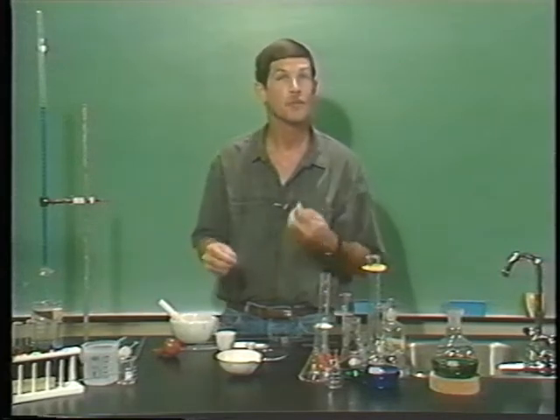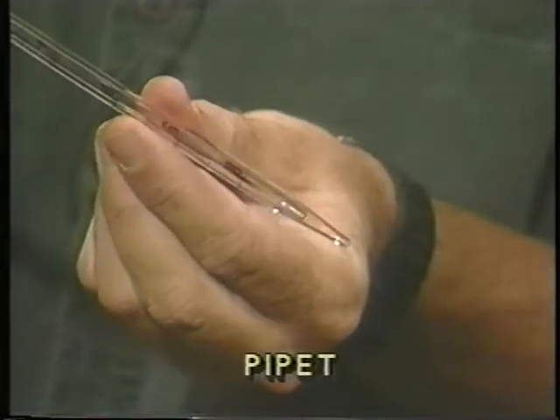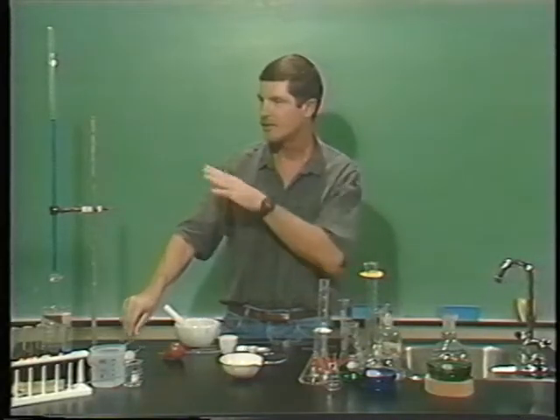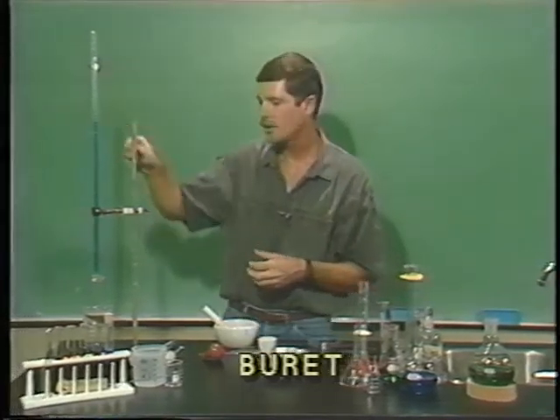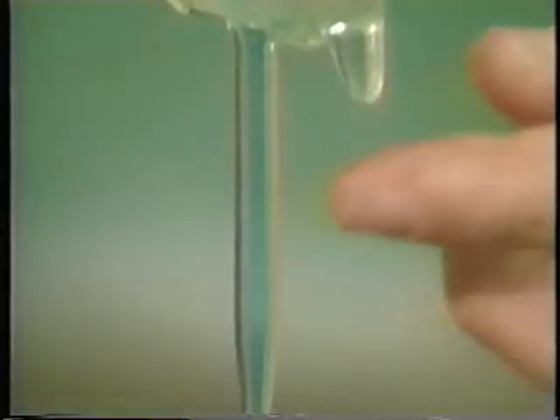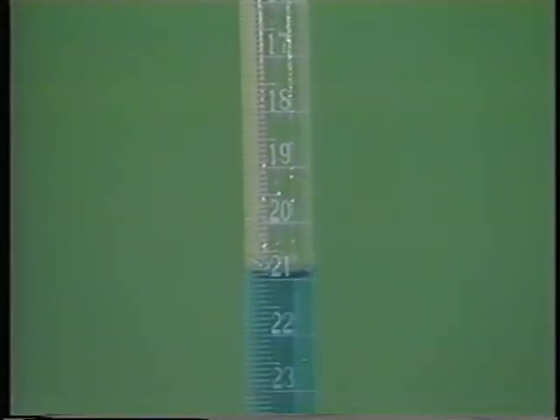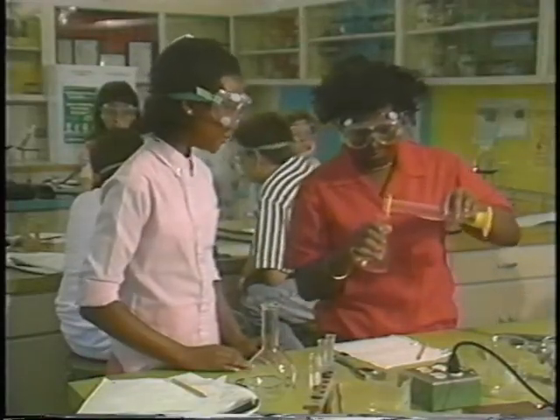Then I have two different instruments for measuring liquid volume again, like our graduated cylinder. One of them is called a pipette, and it measures very small amounts of liquid. This particular one measures only 2 milliliters. And finally, this long glass tube over here is called a burette, and it's used like a graduated cylinder, but you pour the liquid in the top, and by turning the little stopcock down here, you can let out the exact amount of liquid that you want. I hope each and every one of you will take the names of this equipment seriously and learn them. So when you see those directions that say pour 50 milliliters of solution A into your graduated cylinder and then transfer that into your Erlenmeyer flask, you know what they're talking about.